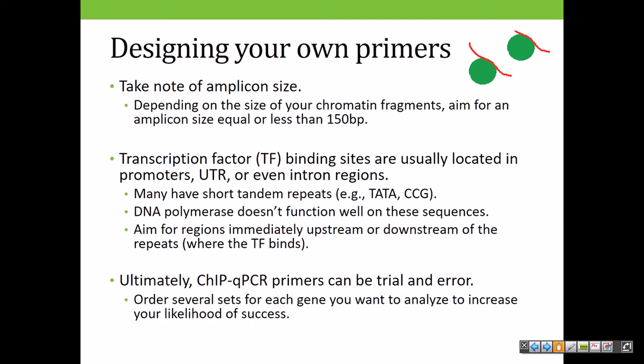All right, so ultimately, though, ChIP-qPCR is a little bit of trial and error, especially with the making of primers. So if you're making them, order several sets: design independent, slightly modified sets, and test them in a non-template control and on genomic DNA. Am I forming primer dimers? No, great. Am I getting a quantifiable product? Yes, wonderful, that's the winner.